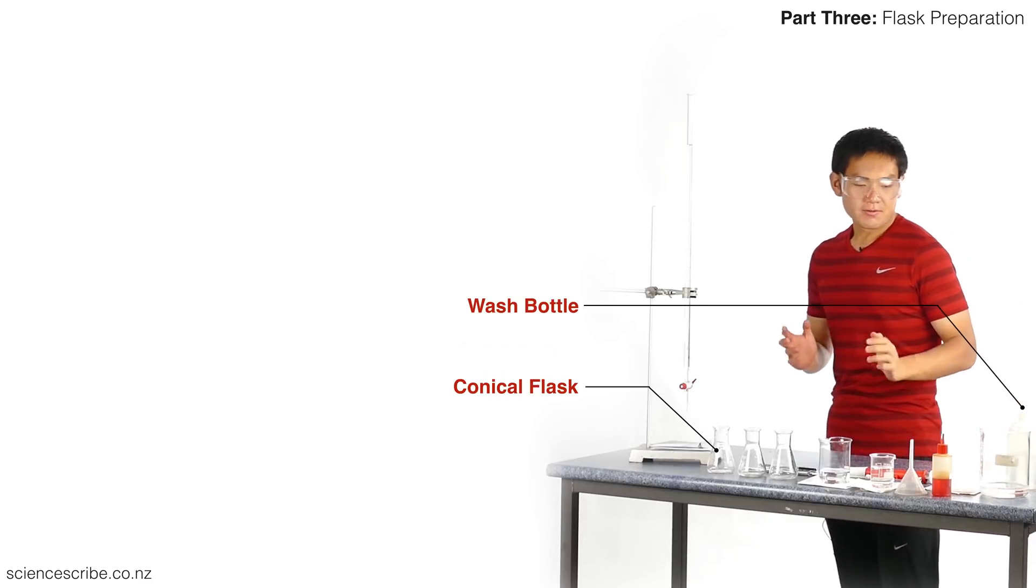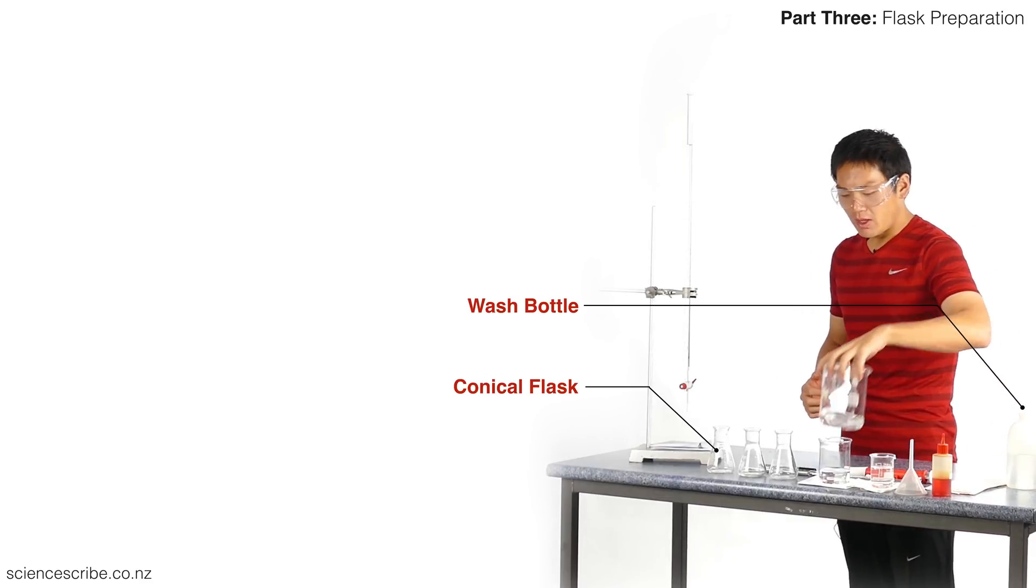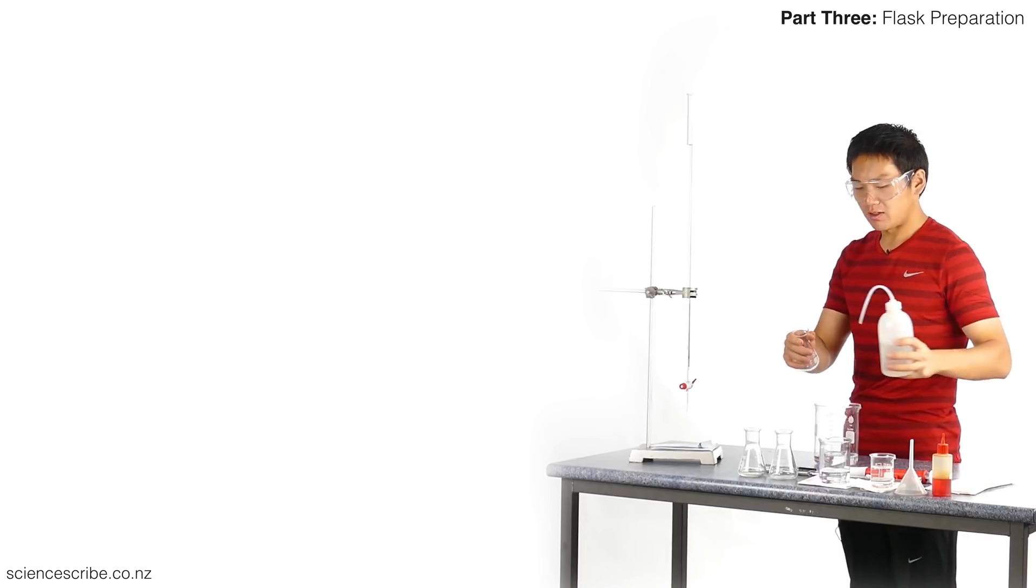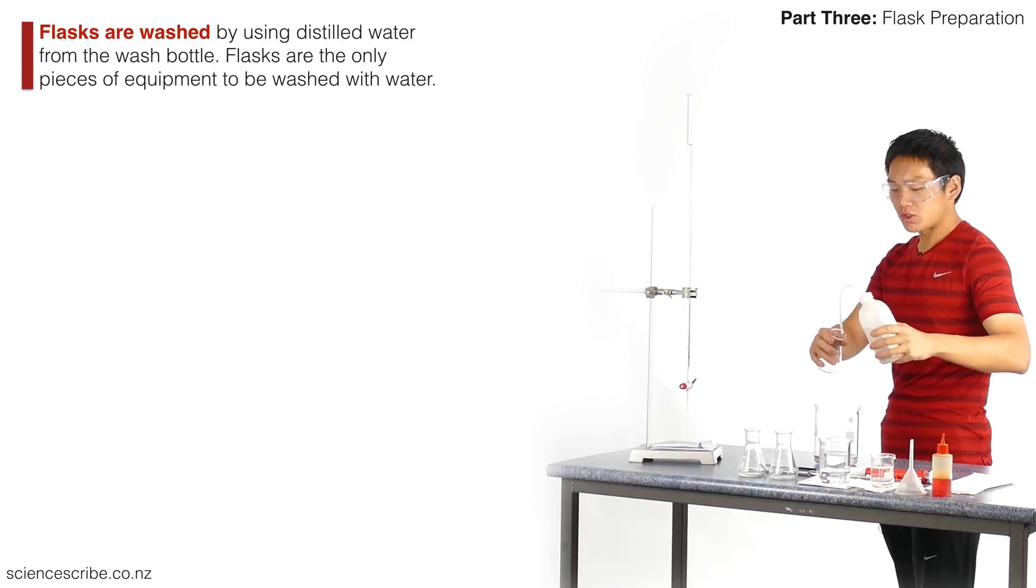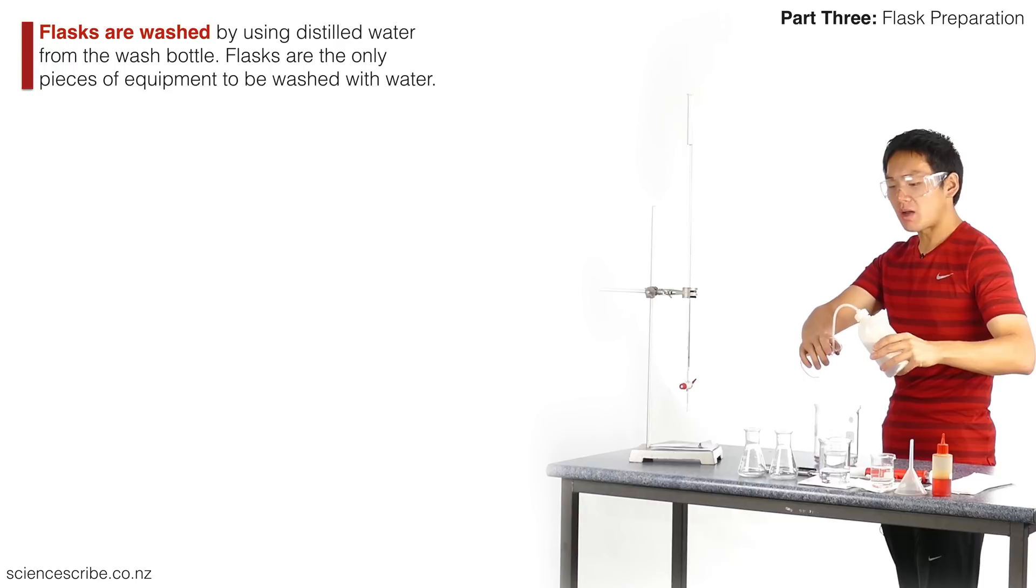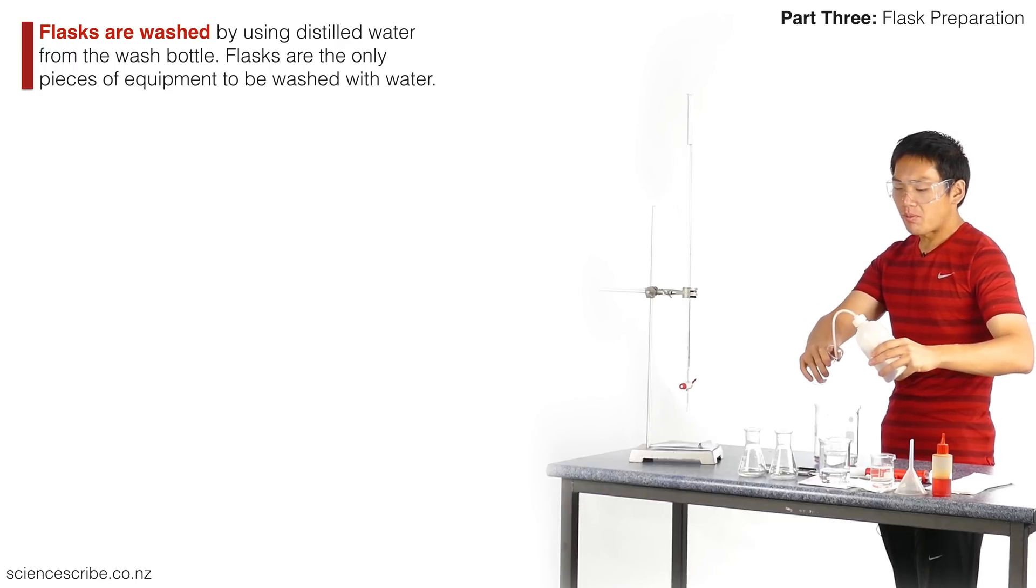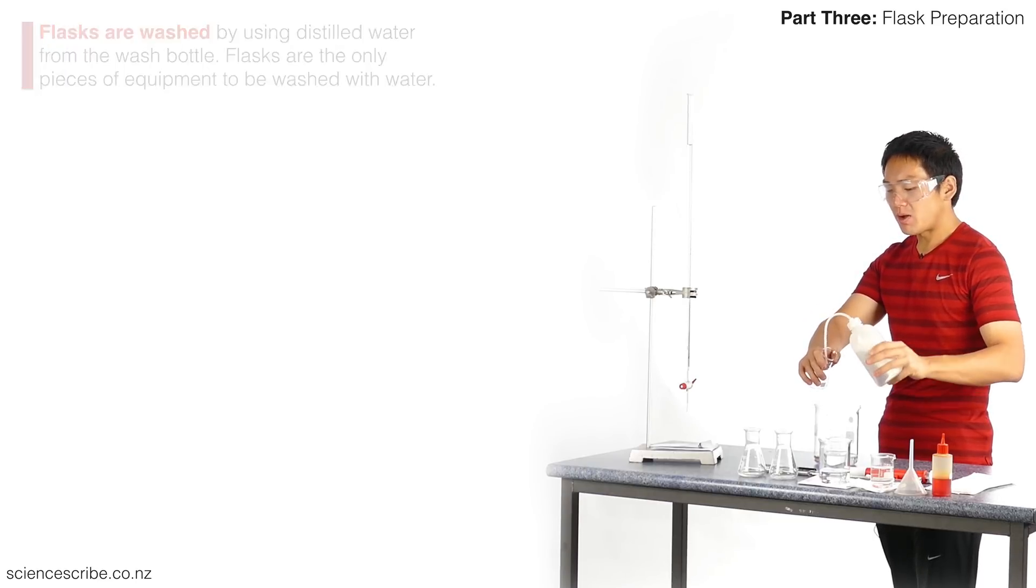To prepare our flasks, the first thing we're going to do is wash them. Flasks are the only thing that we wash with distilled water from our wash bottle. I'm going to squeeze down on my wash bottle and at the same time rotate my flask while positioning the end so that I get all the walls on the inside.